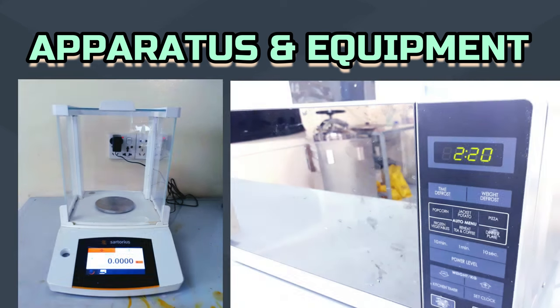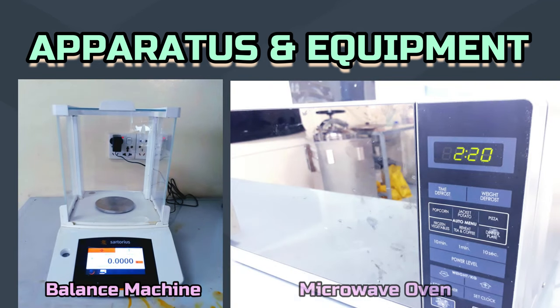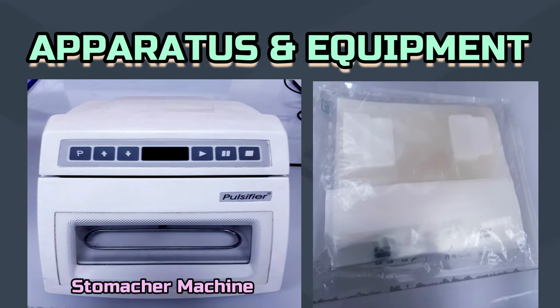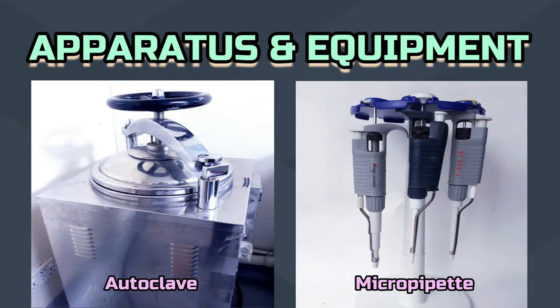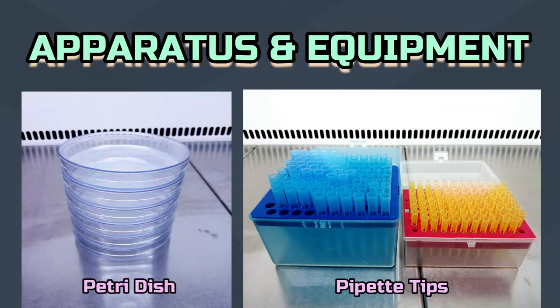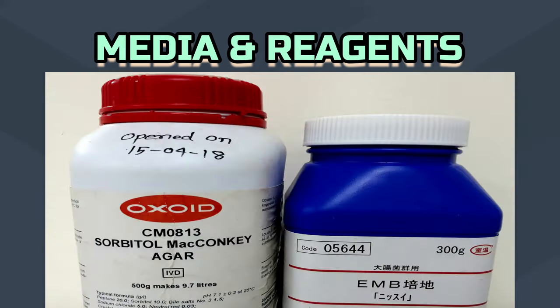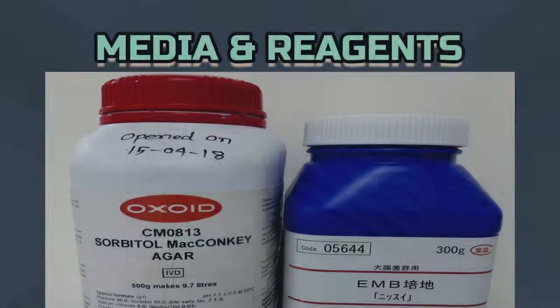To conduct the experiment, we need balance machine, microwave oven, biological safety cabinet, incubator, stomacher machine, stomacher bag, autoclave, micropipette, petri dish, pipette tips, spatula, inoculating loop, pepton, sodium chloride, chromocult coliform agar, EC broth, eosin methylene blue agar, and sorbitol McConkey agar.